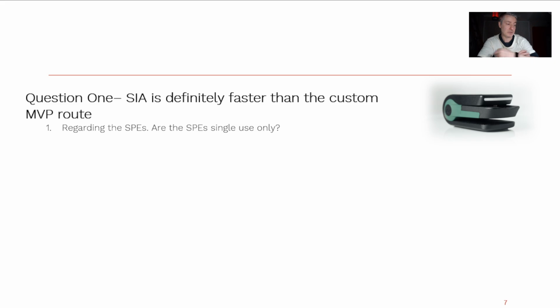The reason, from a business perspective, is that otherwise you're in the business of trying to guarantee that the electrode is never changing when the customer next uses it. It's very hard for you to guarantee that, in fact almost impossible. You cannot predict what they're going to be doing with it, how they're going to store it, how they're going to expose it to light, or how they're going to leave it in a corrosive atmosphere. You've got no control over that.